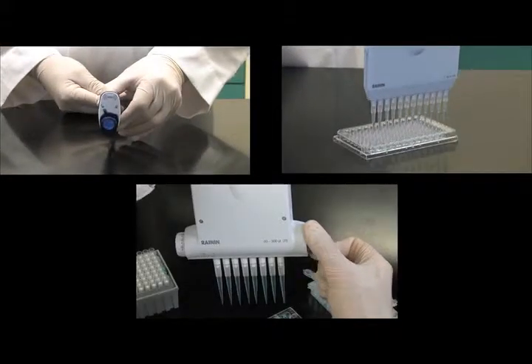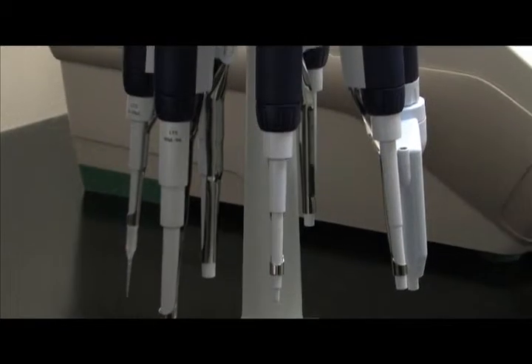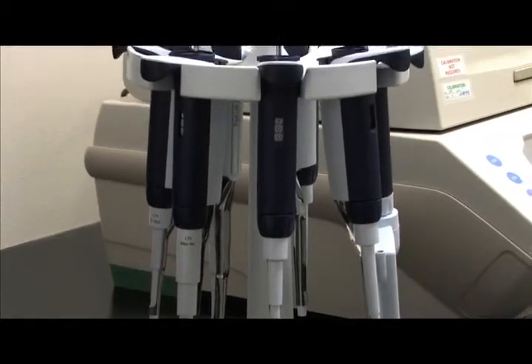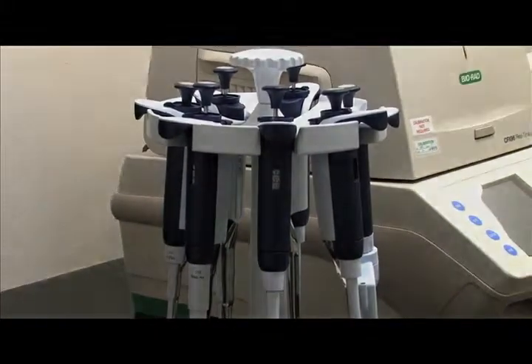Single channel, multi-channel and adjustable spacer. Raynin's Pipette Lite XLS offers precise ergonomic performance for any pipetting application.